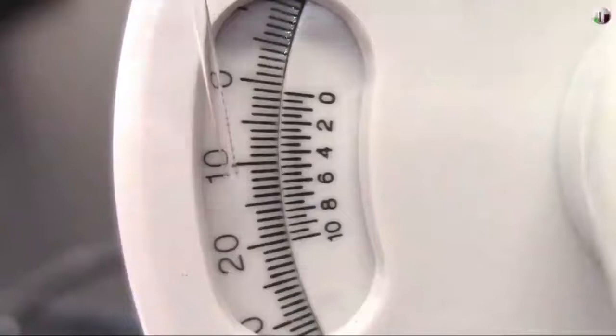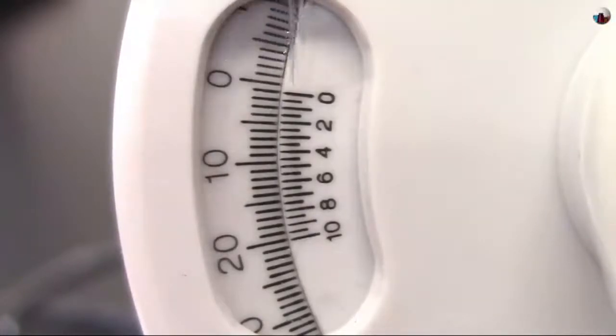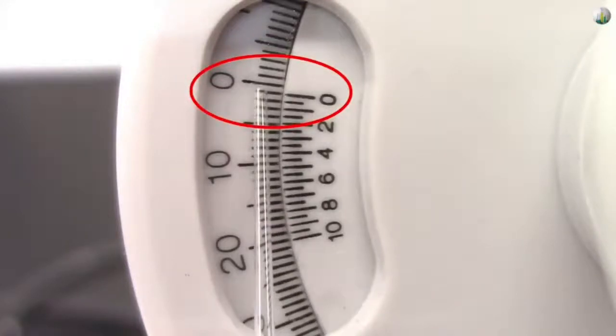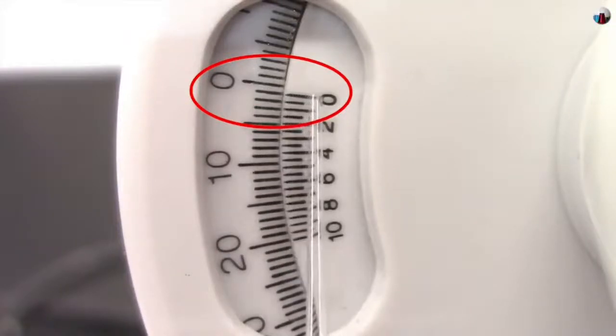The outer scale gives the whole number for the observed rotation reading, and the inner scale gives the first two decimal places. Look for the outer scale reading which meets up with the 0 of the inner scale. If it exactly meets a line, then note the value of the outer scale. If it is in between two values, then use the lower value. In this example, the whole number is 1.